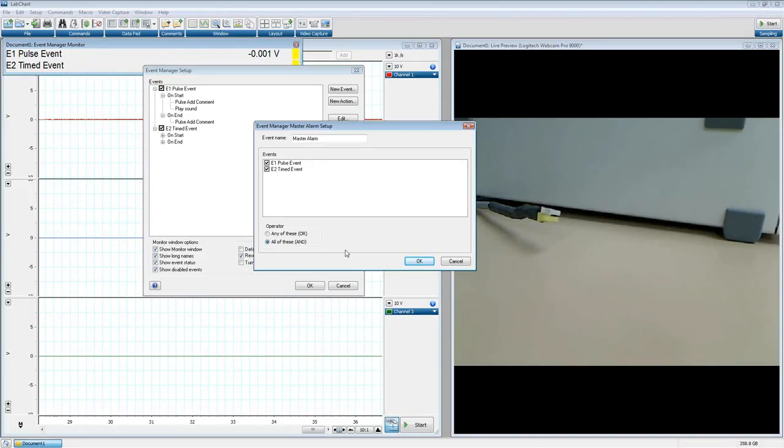So say, for instance, you're monitoring respiration and pulse in, say, a subject, a rat, and we want to know if we over-anesthetize, but we don't want to know just if the respiration depresses or if just the pulse depresses. We want to know if they both do it. If they both do it, then we need to back off what we're anesthetizing the animal with.